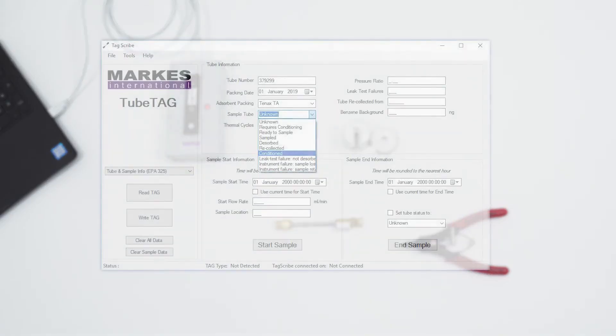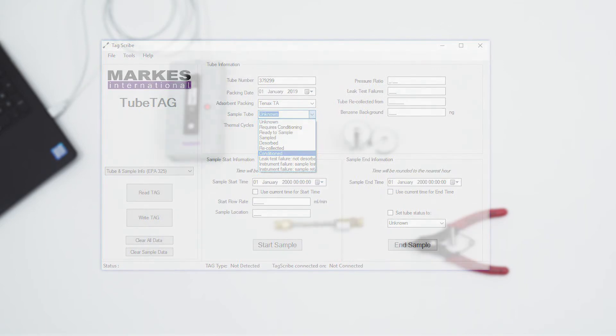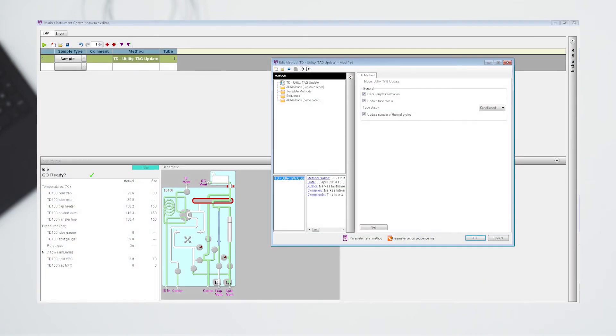If you would like to keep track of sorbent tube status at this point, you can update the sample tube on the tag to conditioned. To save time, you can do this as a batch update on the MIC software.